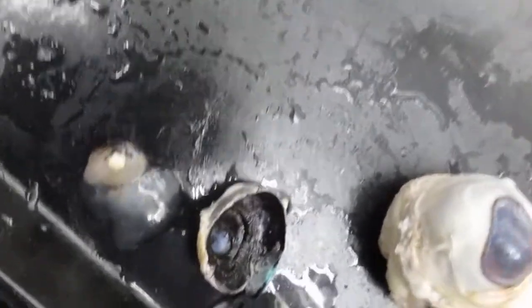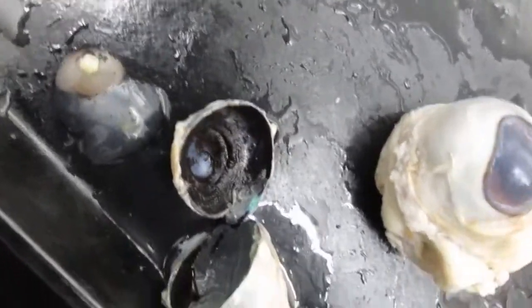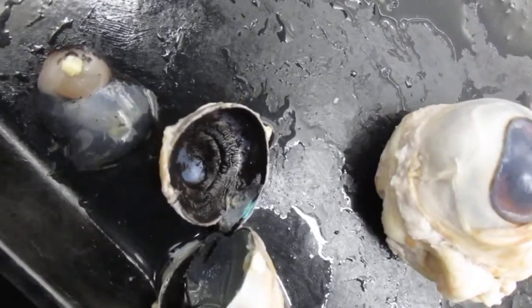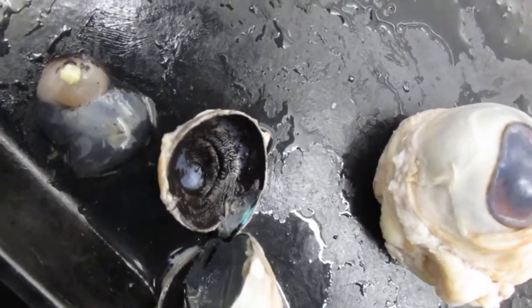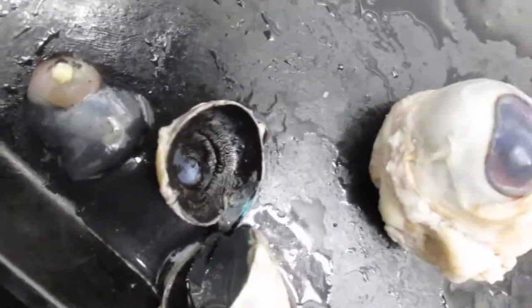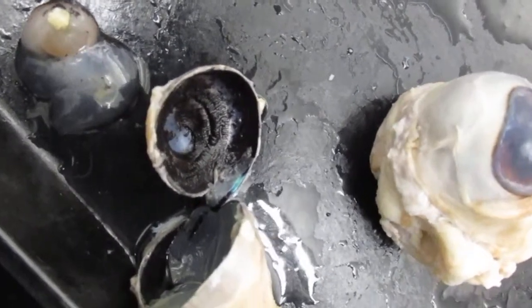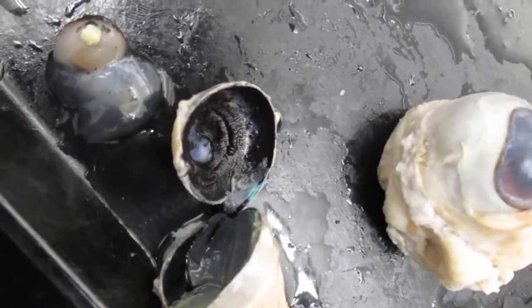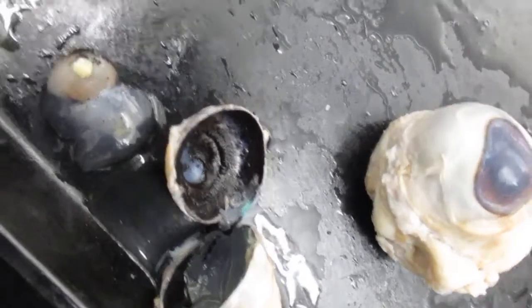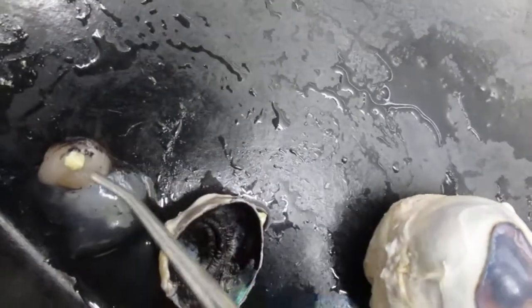And if you look right behind the cornea, there's fluid. That's the aqueous humor, which is very clear and thin. And when I cut the eye open initially, it came out. And then you have your lens, which is right here.